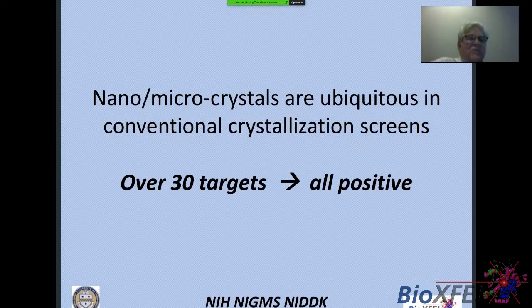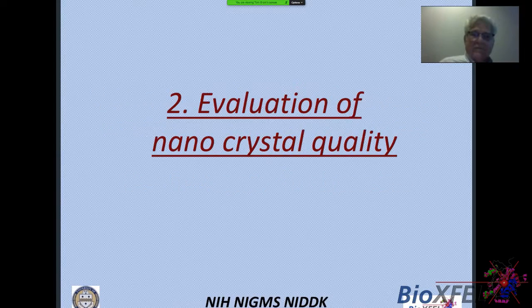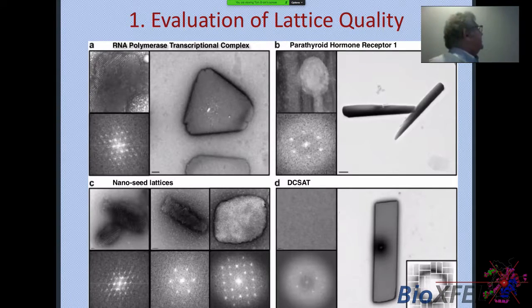But I think both of these observations are largely restricted to small soluble proteins, and the stories will certainly be very different for membrane proteins and for large complexes. In any case, you get to see whether the crystals are there, and you do get to see as well something about their quality. So these are crystals, and these are optical diffraction patterns taken from masked out areas of these images. And these patterns turn out to be very well correlated with the observed X-ray patterns from the same crystals when they were examined later.